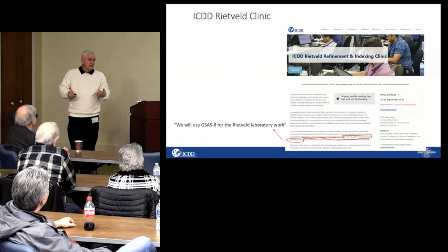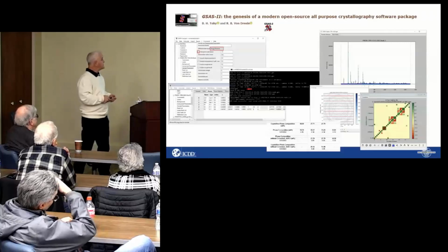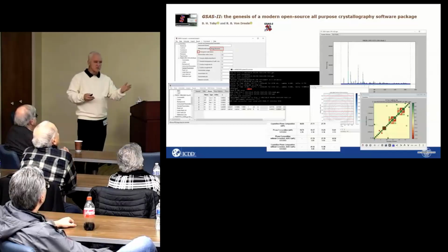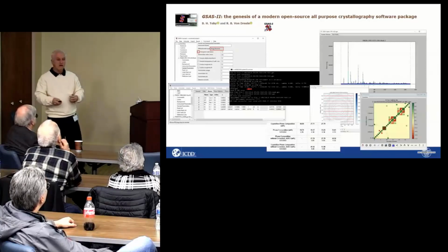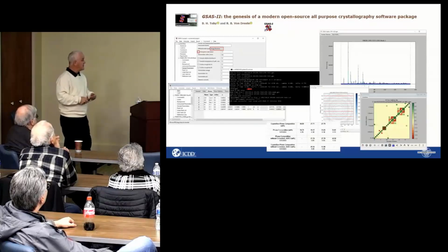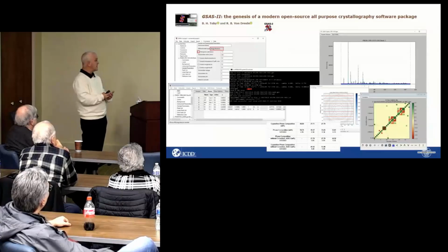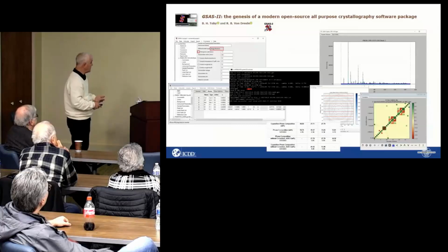The clinic itself has evolved, and in one of the lines we have here is that we have switched over, and for a few years now we use GSAS-II, okay? And with the GSAS-II, we now have the Toby Von Dreele version, but now you have many, many more features. And we heard a number of them here today, particularly things like being able to work with 2D data. You can work neutron data easily, lab data, synchrotron data. But again, the aim is the same: can you do some quantitation of phase or phases that are present, including the thoughts around amorphous material? What's the amorphous content of your material there?